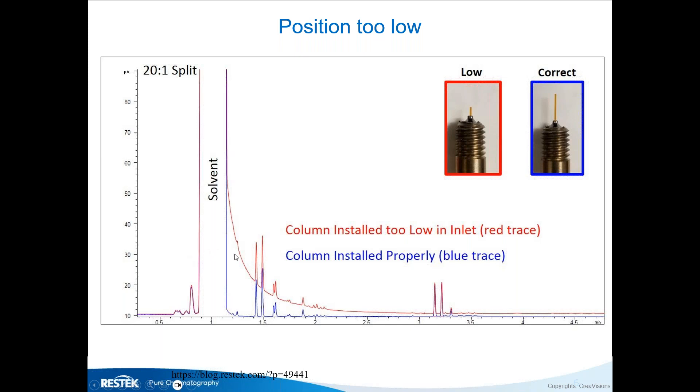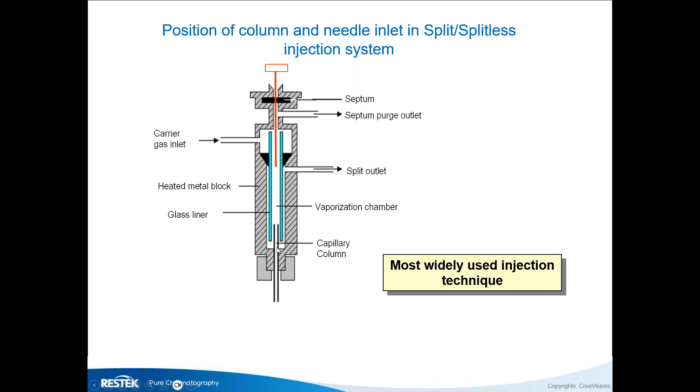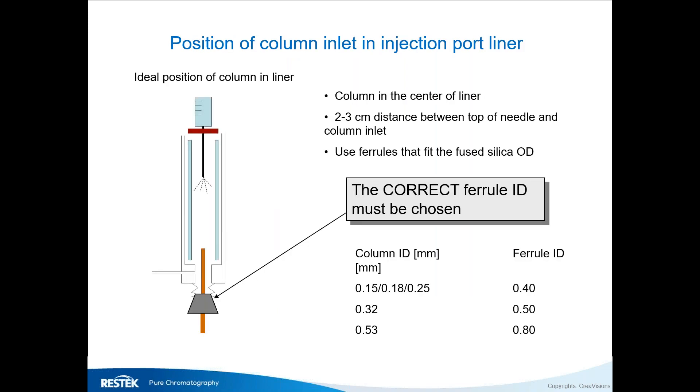The solvent normally should be a very nice sharp peak, like the trunk of a tree. If you put the column too low — below the bottom of your liner — you're going to see tailing. The analyte response is the same, so that's not the issue, but it's much better to integrate on a straight baseline. Your column always needs to be at the bottom of your liner, not below it.